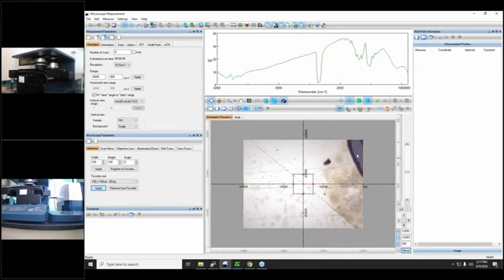At this moment, the first measurement that I'm going to make is the reflectance, and what I'm looking at now is just the golden mirror. This aperture that we see here is 100 by 100 microns, and this aperture can be rotated, or actually we can even change the size. You can also have a favorite size here, and I already have input 100 by 100.